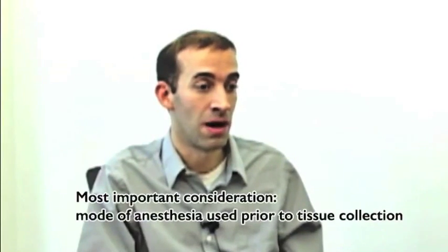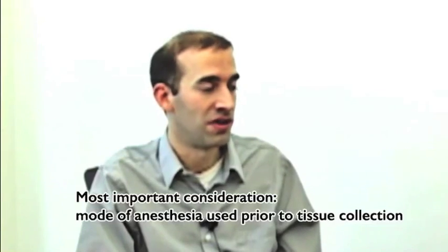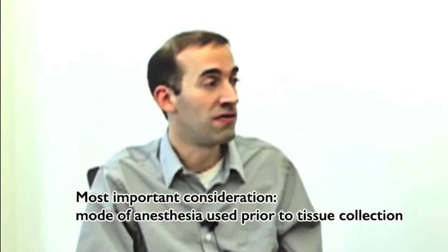One of the biggest areas of concern in an animal study is the mode of anesthesia that you're going to use prior to collection of the tissues. We found that procedures that may work fine for other studies, such as genomics or proteomics or classical biochemical studies, may not work very well at all for metabolomics, and that's something that we found it's very important to be aware of.